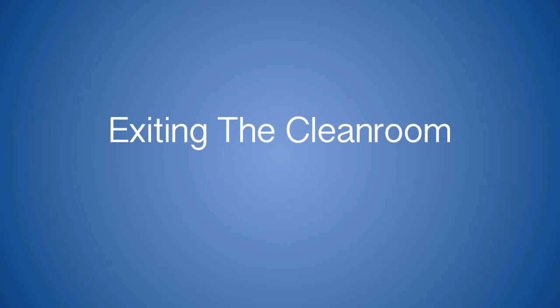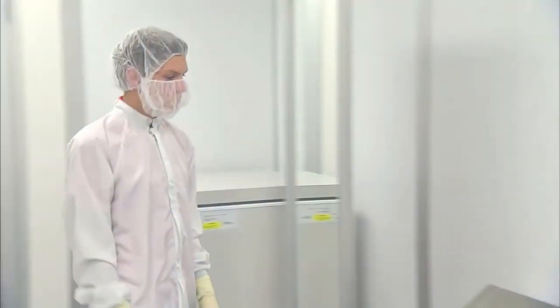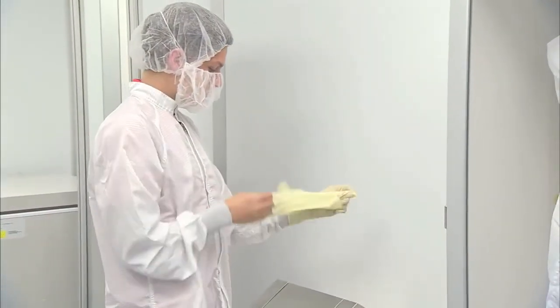Exiting the cleanroom. When finished in the cleanroom, your next step should be to degown in the gowning room. The degowning process goes in reverse order as the gowning process, from bottom to top. Here is the degowning process for an ISO 7 or 8 cleanroom. Take off your gloves and dispose of them in the proper receptacle.